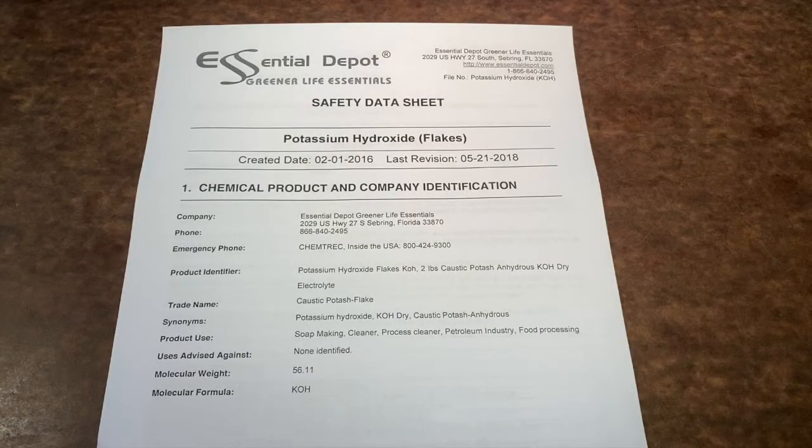Hi everyone. As part of your planning memo due before each lab experiment, I've asked you to conduct a hazard review of your experimental plan, which is a key part of ensuring you, your team, and others in the lab remain safe during and after your experiment.